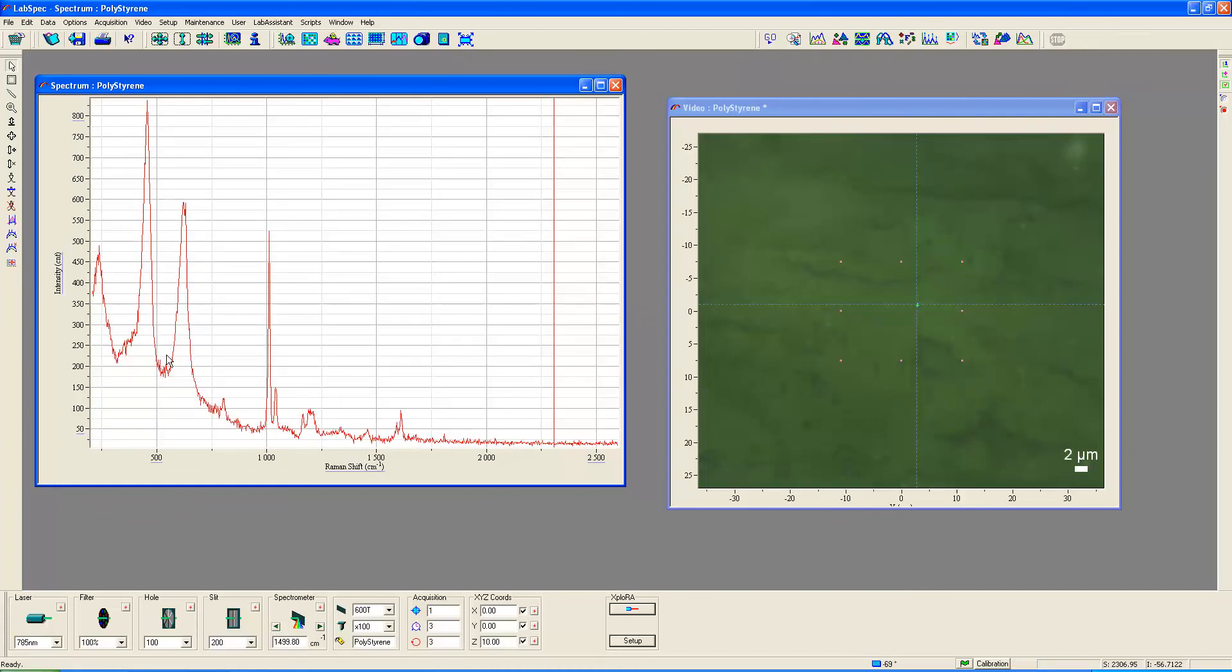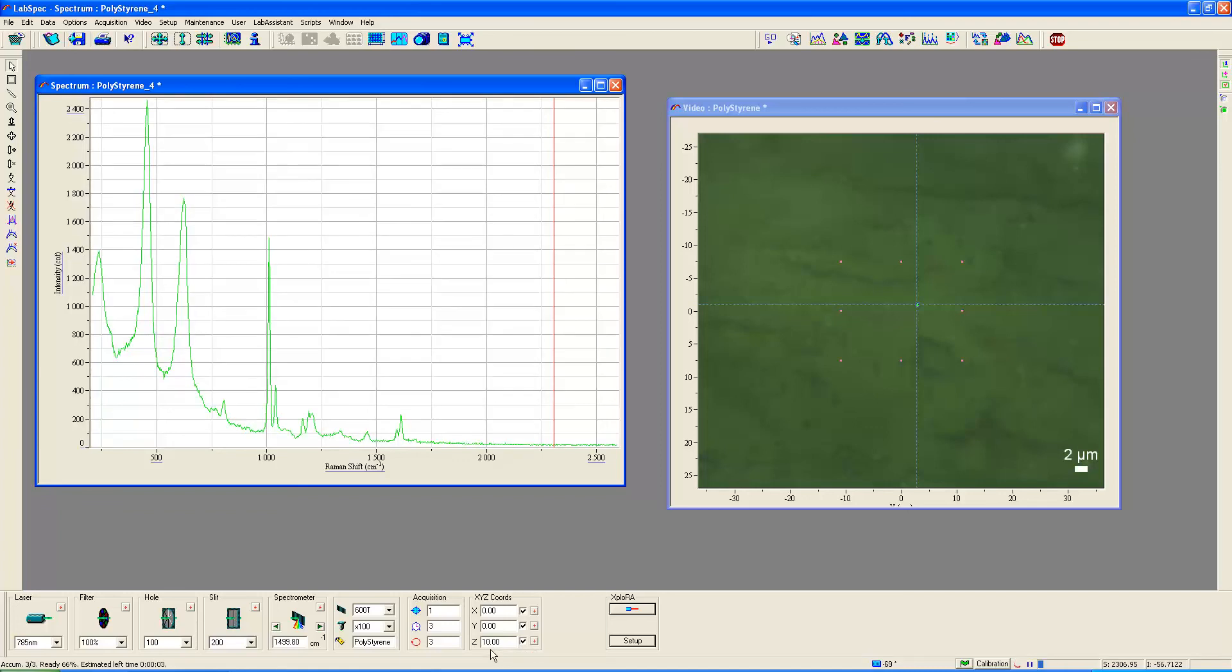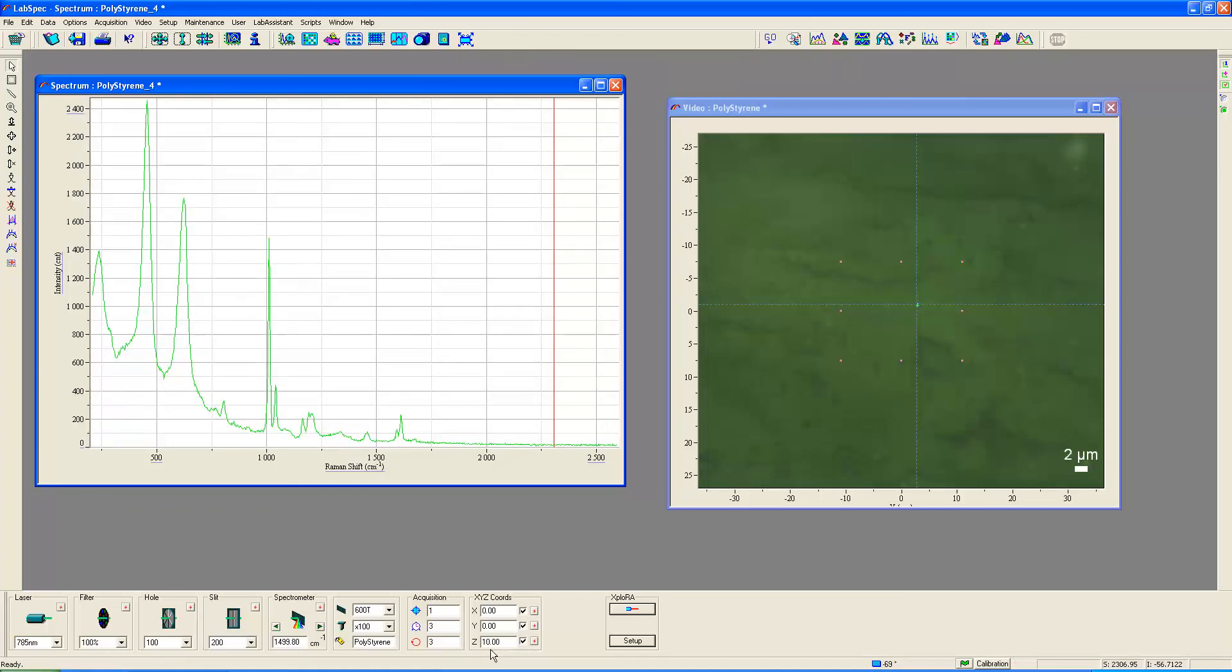Now, I can tell you from experience and because I've worked with this material, these are basically Raman bands of rutile titanium dioxide. So let's get a spectrum of that. And this is, as we see here, it is 10 micrometers below the surface which we've collected this spectrum.